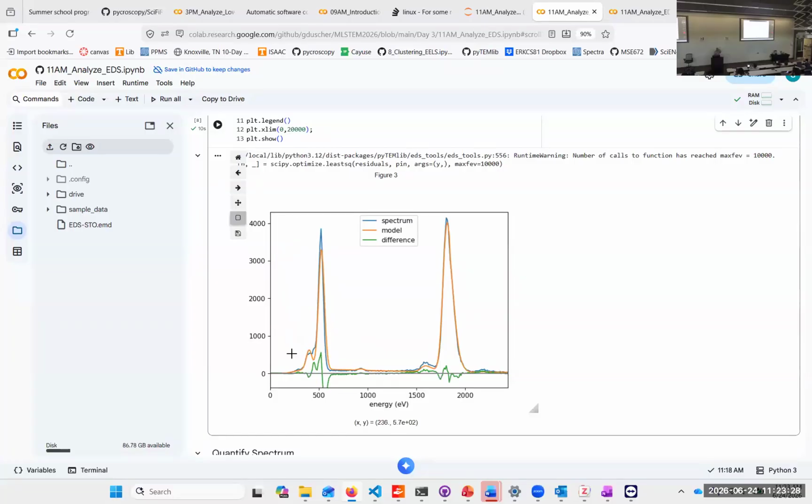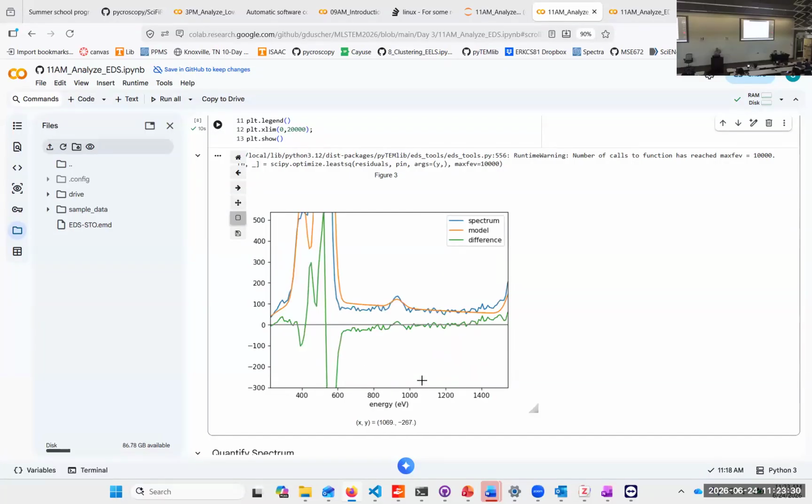The key factor, however, is how does the background work at the low-lying edges, because that's really where the biggest problems are with the background. And that depends now on how well you really know your detector. And in this case, it is actually reasonable. Again, we have a very small error here.